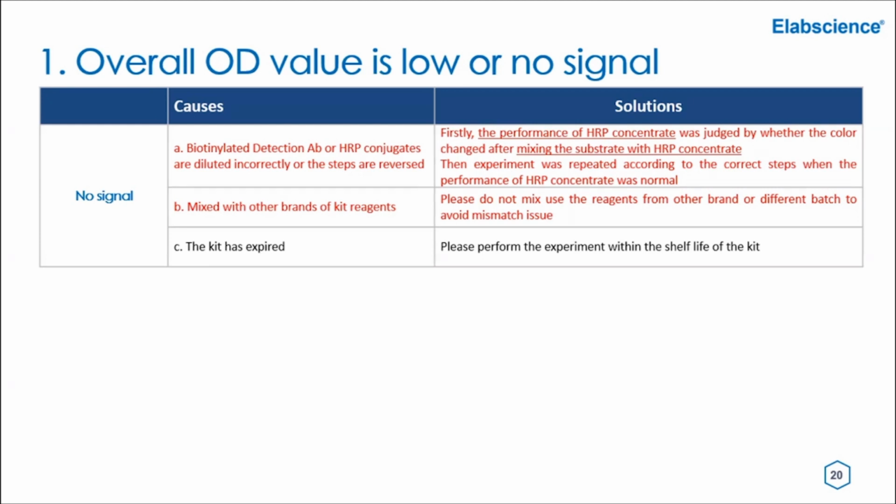If you use reagents from other kits, the result can also be no signal or low signal, because each of our ELISA kits is optimized with its own reagents.